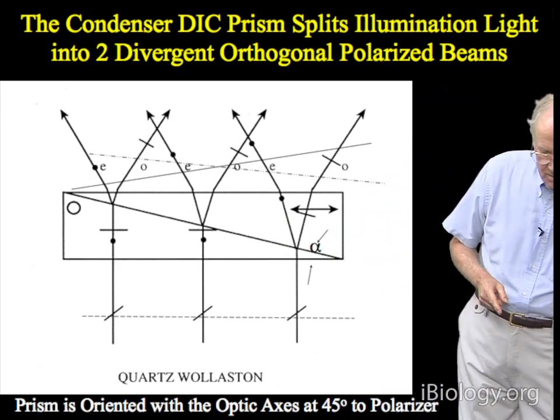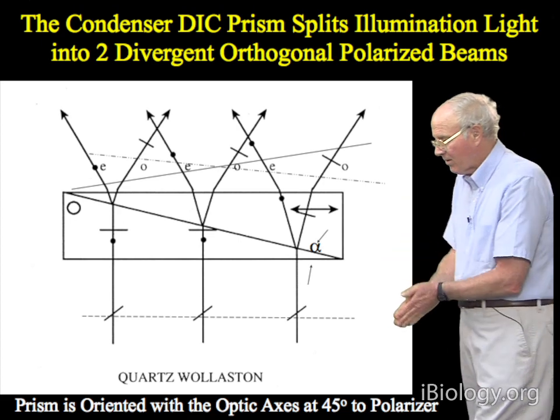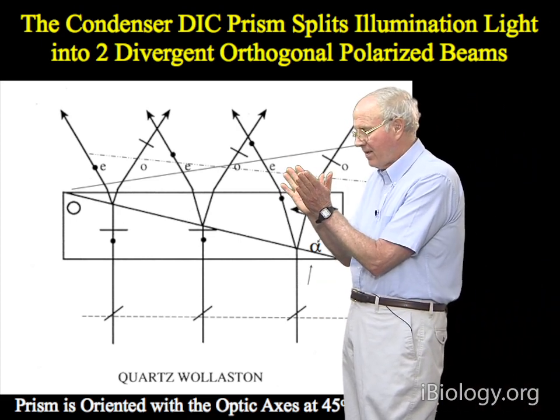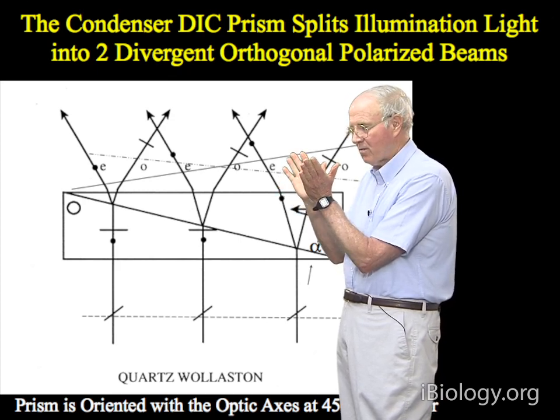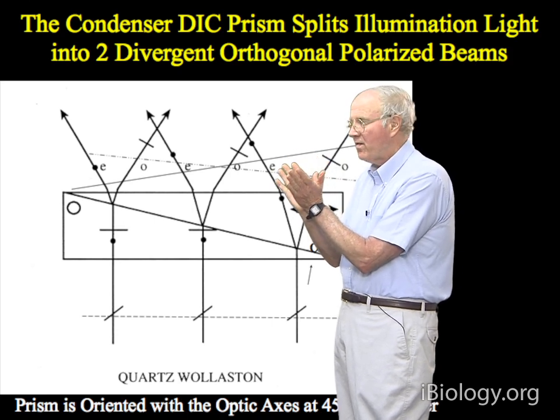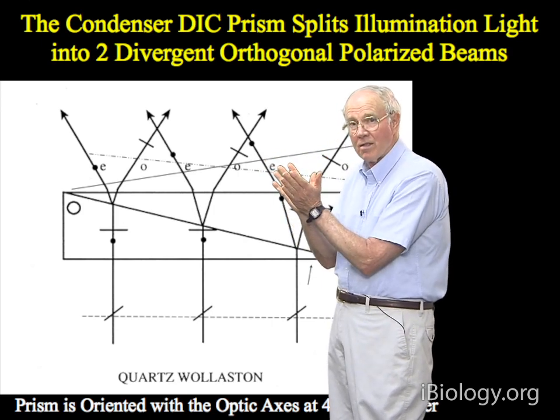Now, when you take plane polarized light coming along through space and you hit a birefringent crystal, instantly the energy from the electric field is resolved into two orthogonally plane polarized light beams, one vibrating in the n sub e direction and one vibrating in the n sub O direction, right?